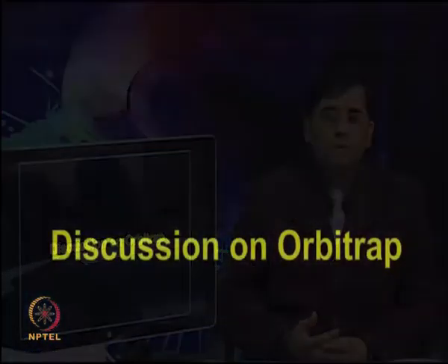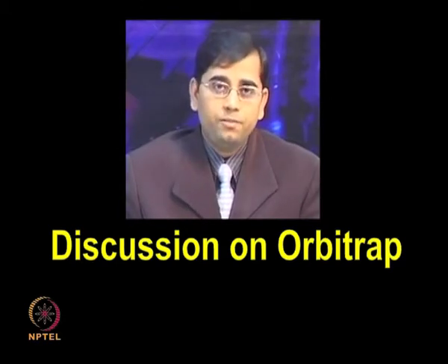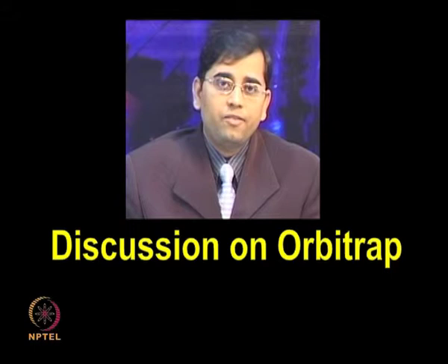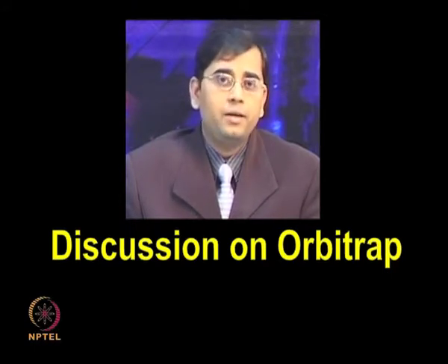So after discussion on the quadrupole time of flight, the QTOF, as well as triple quadrupoles, now let's move on to another latest configuration, the Orbitrap, which has very much similarity with the ion trap, but it is one of the very latest additions to this proteomics workflow, where people are applying this for various types of biomarker discovery and different other applications.